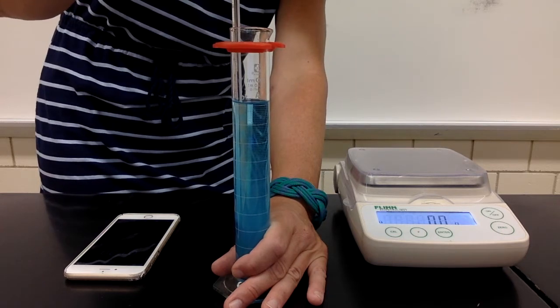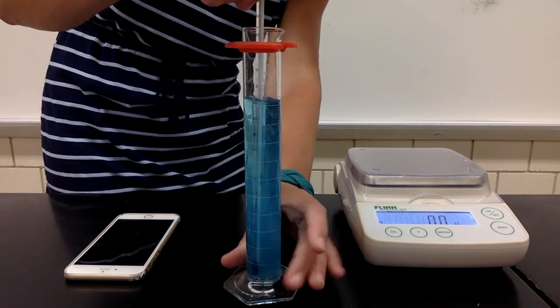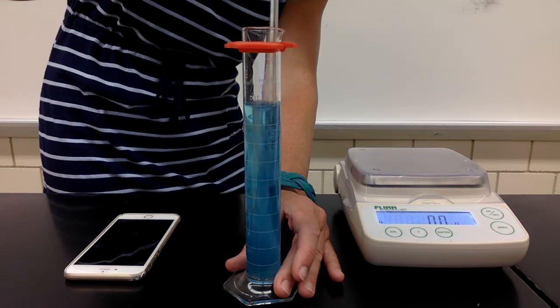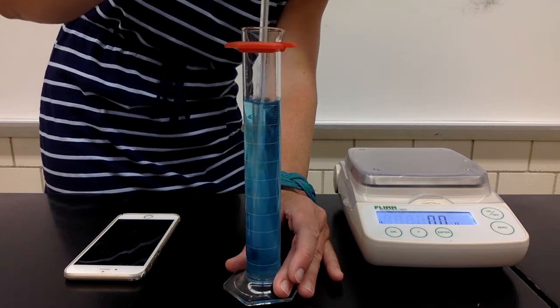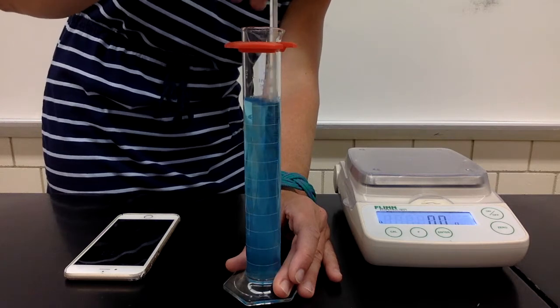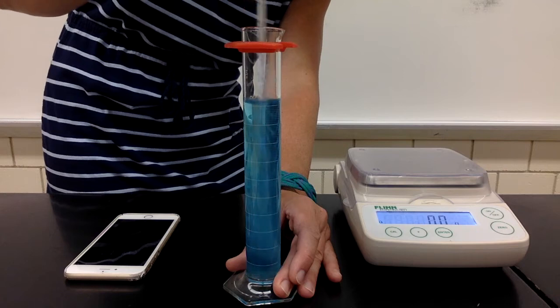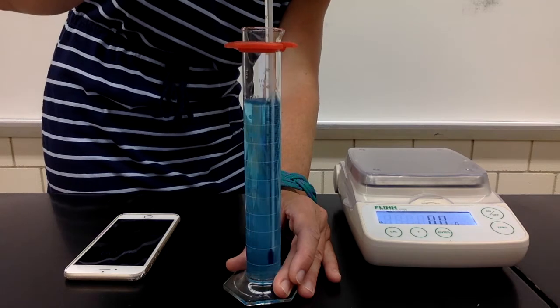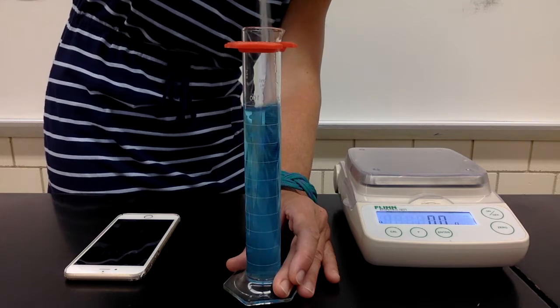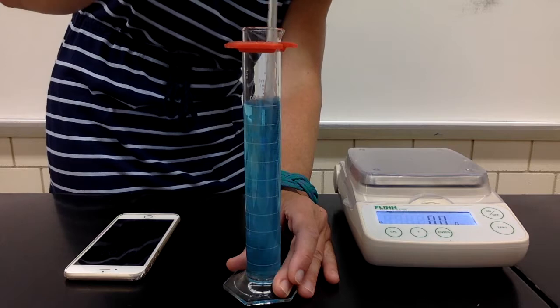There are lots of bubbles in there. It's starting to get cloudy, maybe from all the bubbles that are forming. I'm trying to get the two liquids to mix, but I can still see that they're not 100% mixed. It's more cloudy on the bottom of the graduated cylinder and more clear on the top.